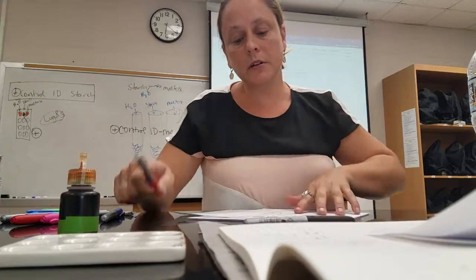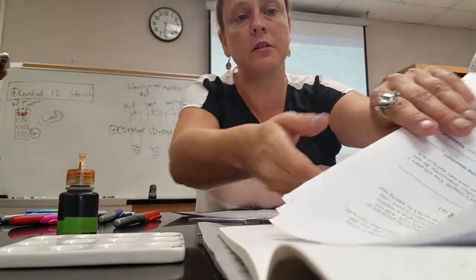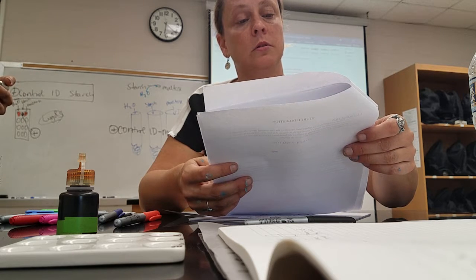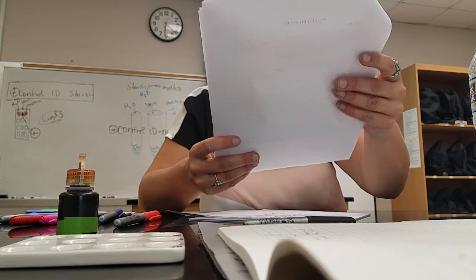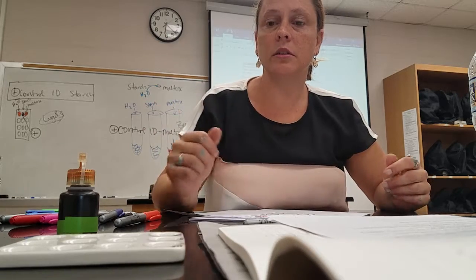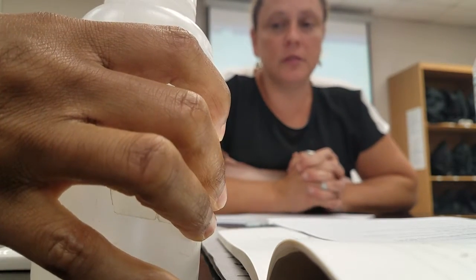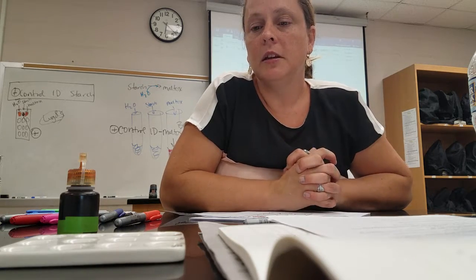But what you're going to notice, and this is where I get confused about how many drops here. Do they just say 1 little drop of pipette? It's 2 drops. They just say 2 drops. The other things are all 2 mLs. So 2 drops of just distilled water. You can just literally do that. I'm just going to squeeze it. It's going to shoot out. Just the best that you can. That's okay. You'll see why. It's not a big deal.